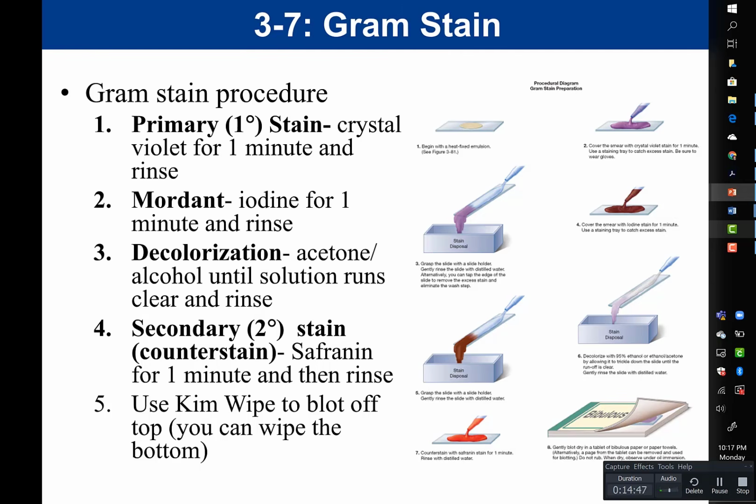You want to know that the decolorization step is the most important step in the entire procedure. This is the part where the stain becomes differential, meaning this is where gram-positive and gram-negative become different, during the decolorization step.